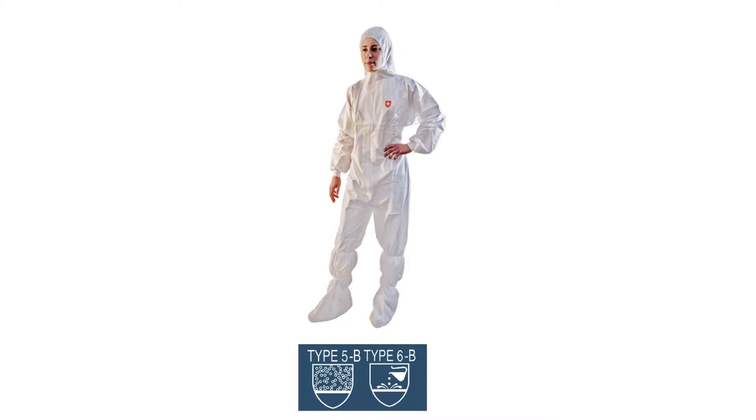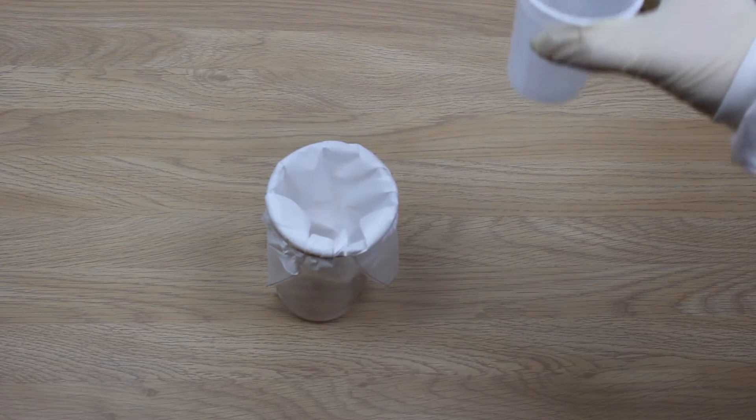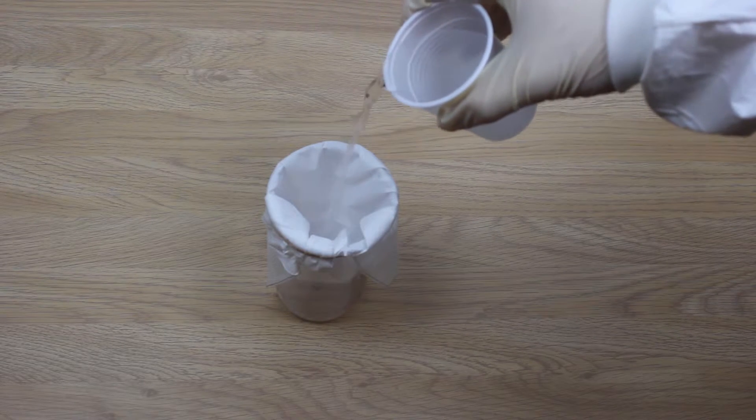Just how effective are Optimum microporous coveralls at protecting you from splash hazards in the working environment? Our coveralls are designed to protect against very limited light mist spray. But look how effective our microporous material is at keeping liquid out.